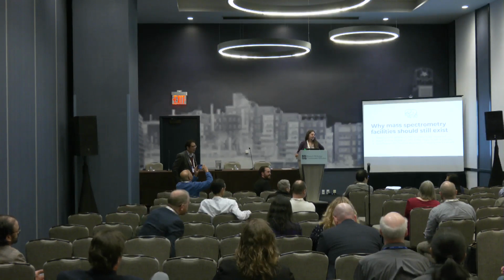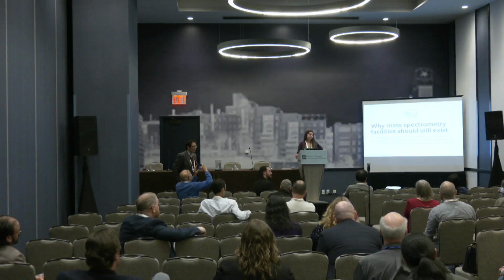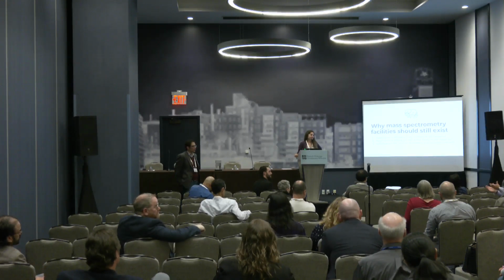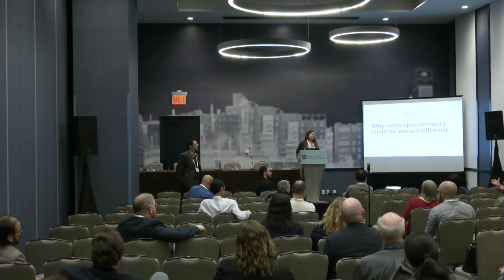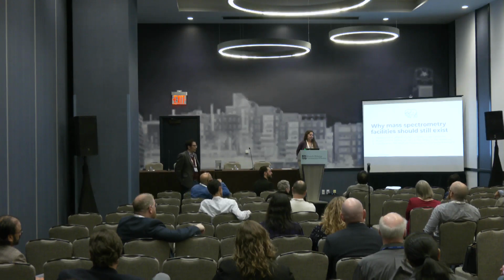Brian, from the informatics standpoint, who's going to own that? We as the mass spectrometry community have put our stake in the ground on how we pipeline some of these data. And each one of these other technologies has its own way to pipeline data. But which part of our community, how are we going to actually, when a biologist comes with a question, how do we answer that question? How do we feed the AI?